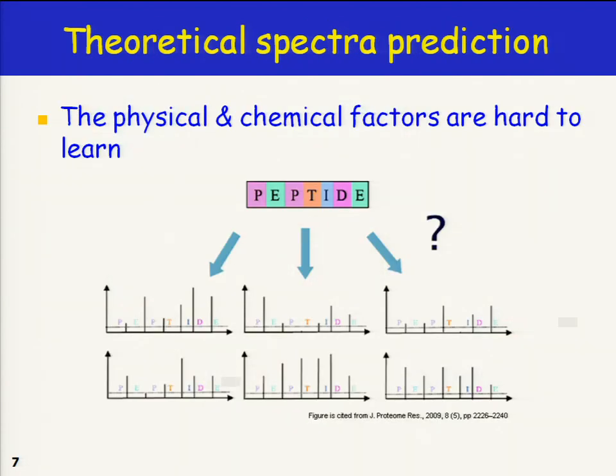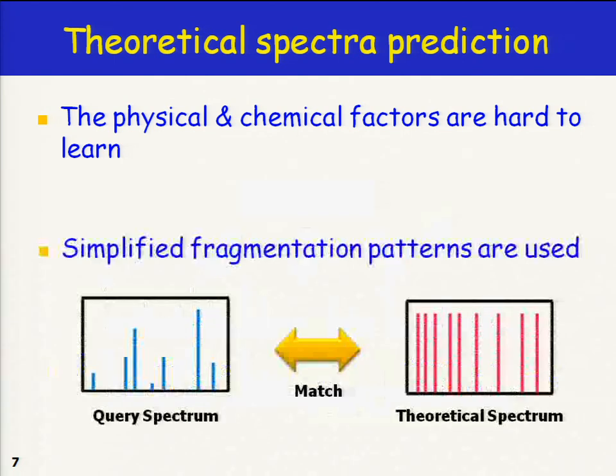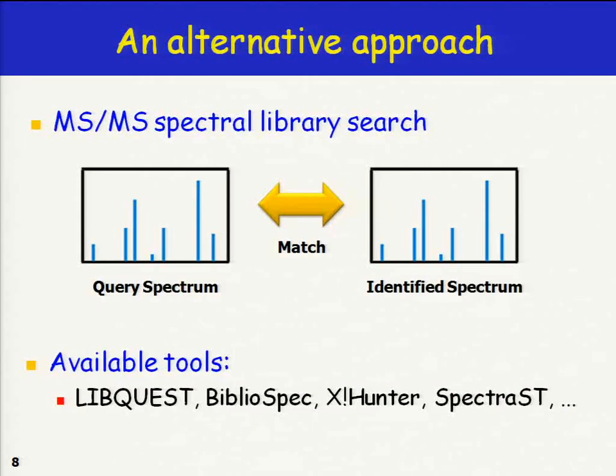It is really difficult to predict, because fragmentation can be very hard to model, especially to predict the intensity of peaks. When we analyze the results, we simply have to do prediction to match the spectrum. It can be similar, but not exactly the same.